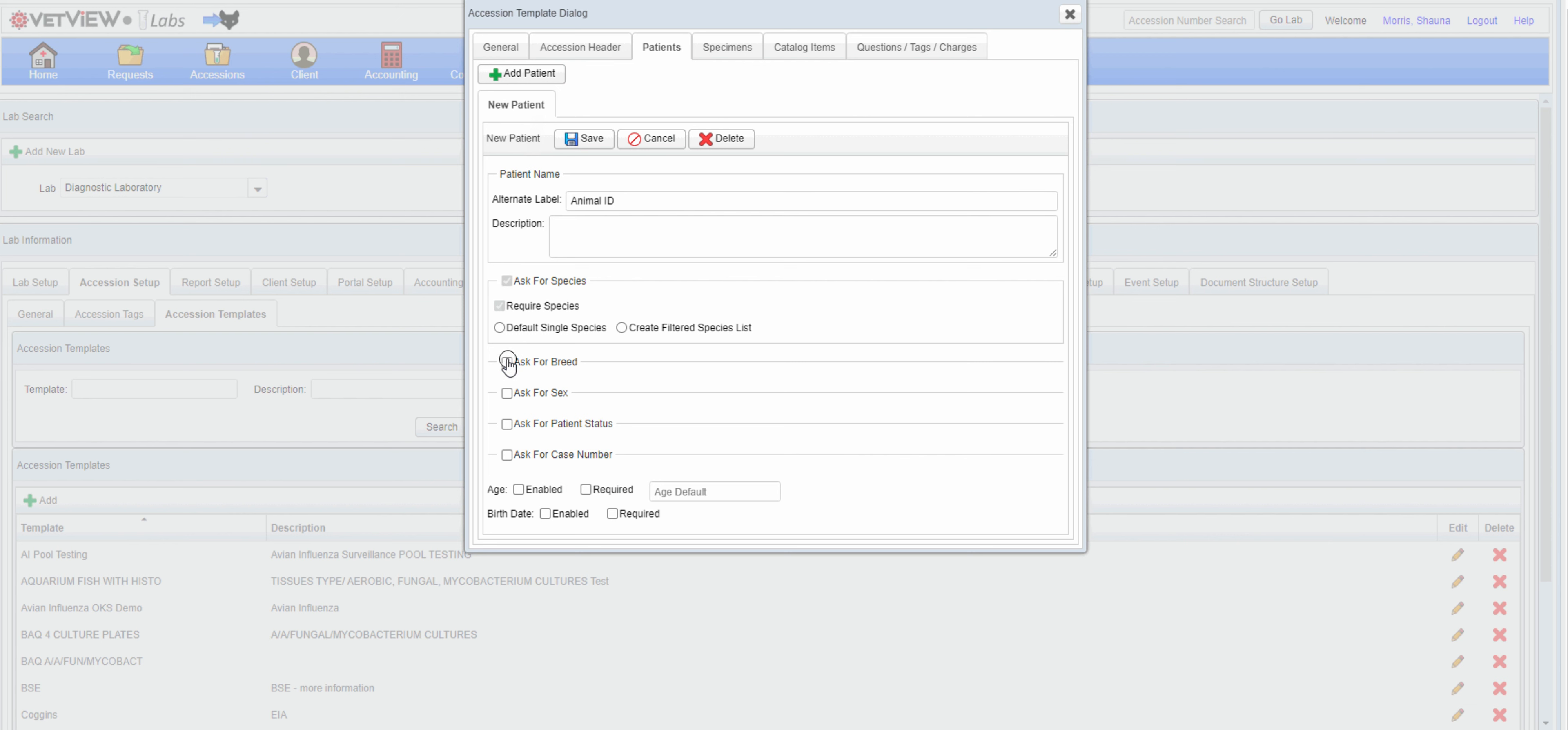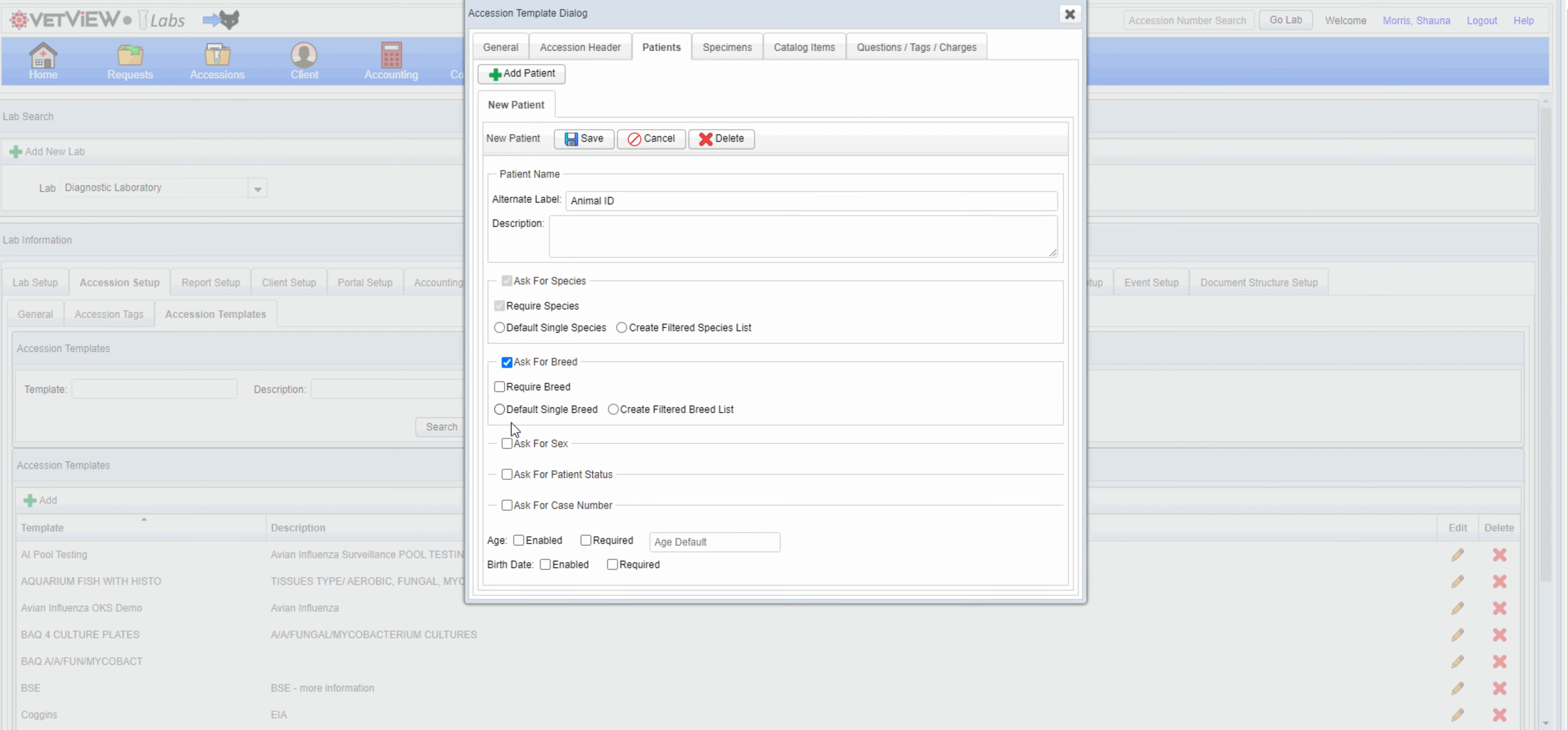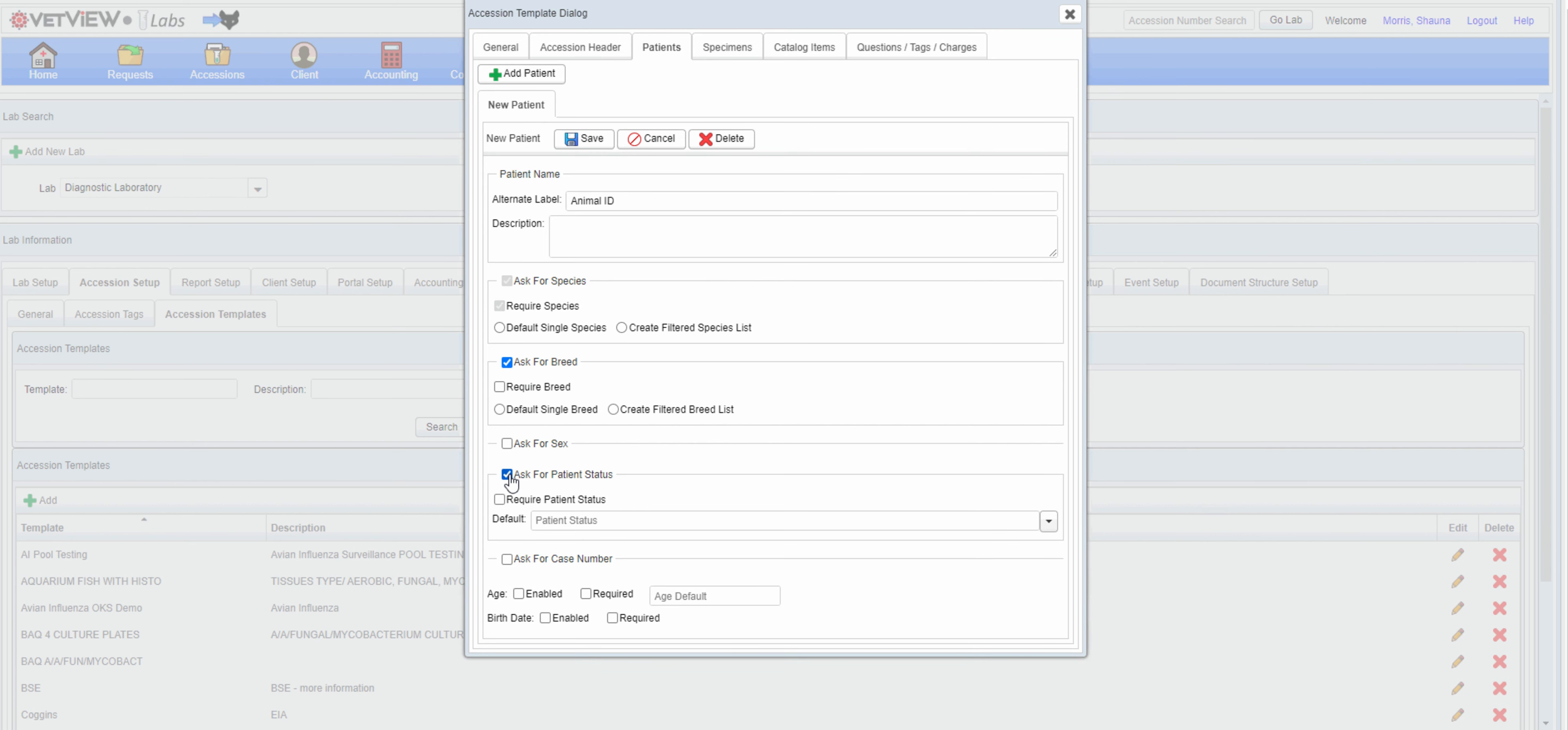Enabling patient details will prompt the user to complete each field. Mandatory information can be marked as required.